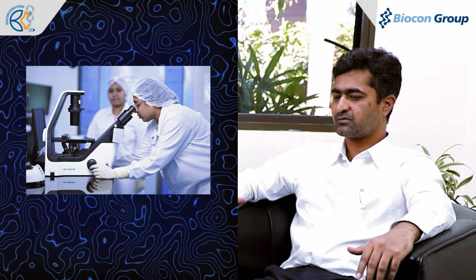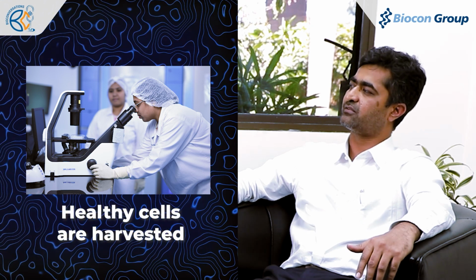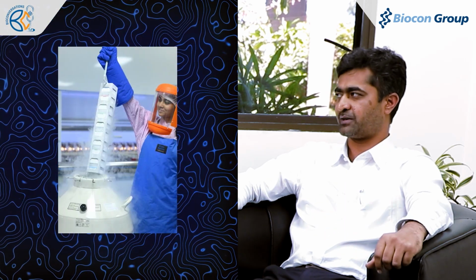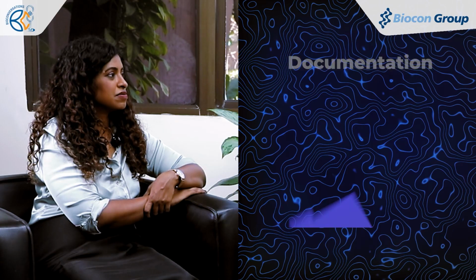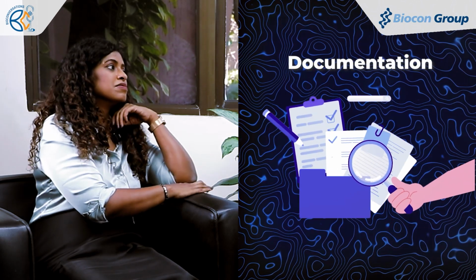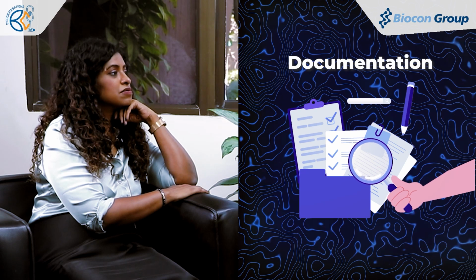So what happens is cells are cultured under defined conditions and harvested when they are in a healthy phase. And then they will be mixed with the cryoprotective agent and placed inside the containers, which we were saying, and then transferred to cryogenic or ultra low temperatures. Right. So during these procedures, we'll have to ensure there is traceability and documentation. So these are other measures that are in place in addition to the scientific requirements.